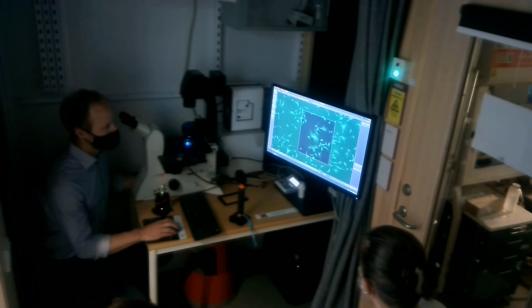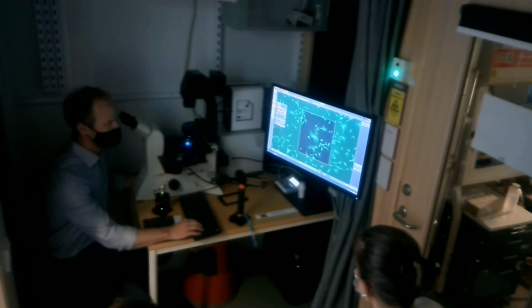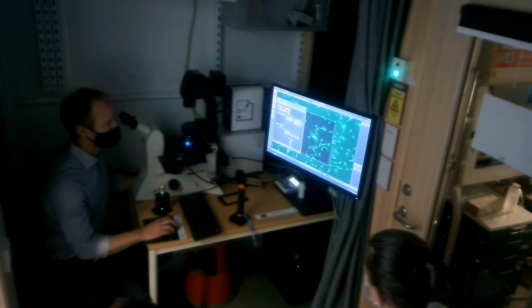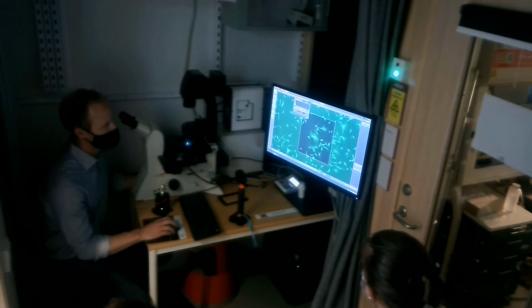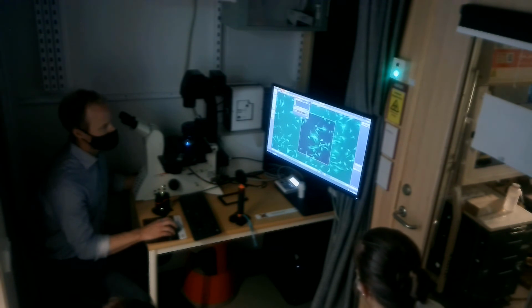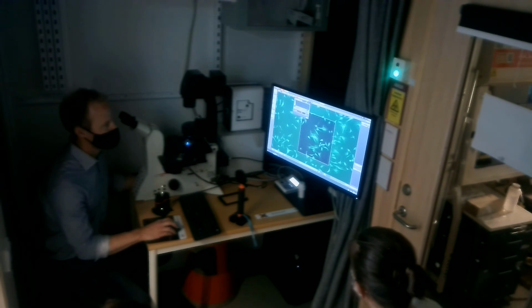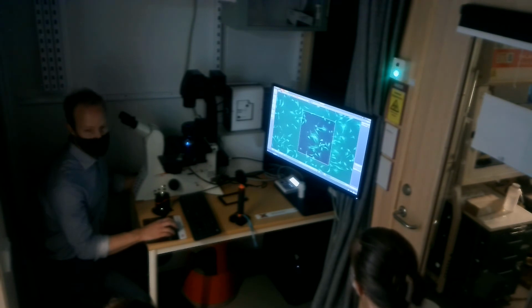We can see that this one is now overlapping with this position where we were. I remember I have quite a long exposure time, longer than I need, so I will reduce that. I still have the auto range, so it adjusts automatically. I'll also drag this down a little bit. I don't think I need, especially for the demo, the full range. This is the histogram that we're looking at here. You can still see that the maximum is around 2,000 counts, so I think that's pretty good. I think these settings will work well for this objective.